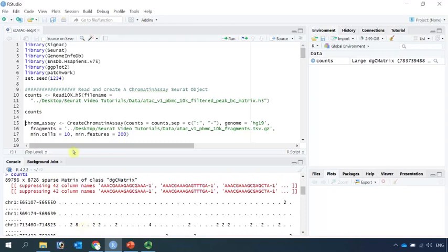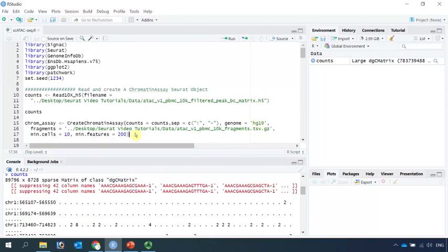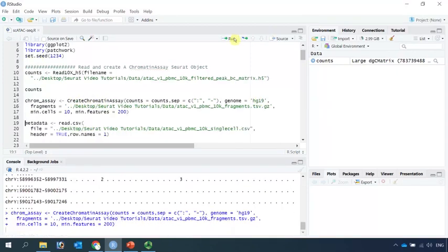Now we can use the counts and also the fragment files to create a chromatin assay. Because the data was generated from human blood samples, we are going to use the human genome hg19. We can go ahead to create a chromatin assay.